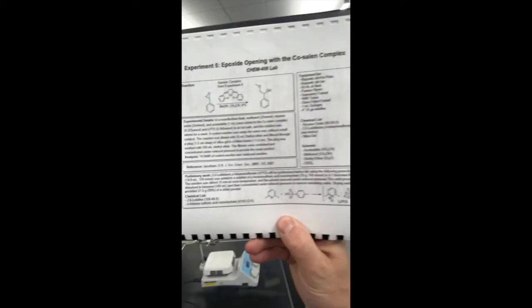That's really for a TA to do, but we actually did this in mass before, so we should have plenty of it. We only need 13 milligrams. It's really just an acid catalyzed reaction. So yeah, I'm pretty much all set up, so I'm going to go ahead and get started.